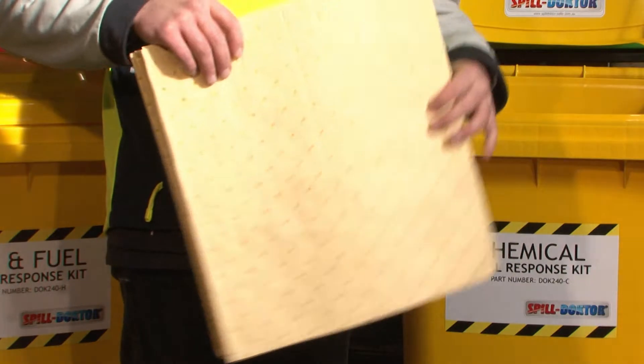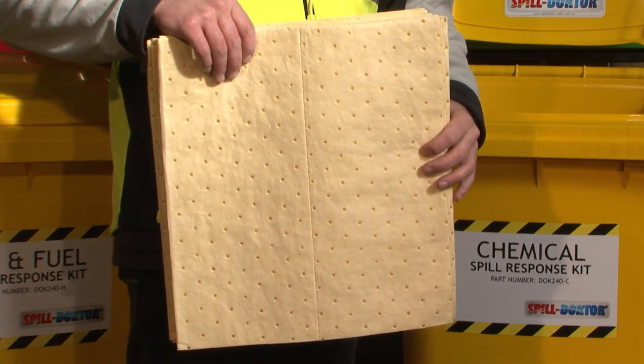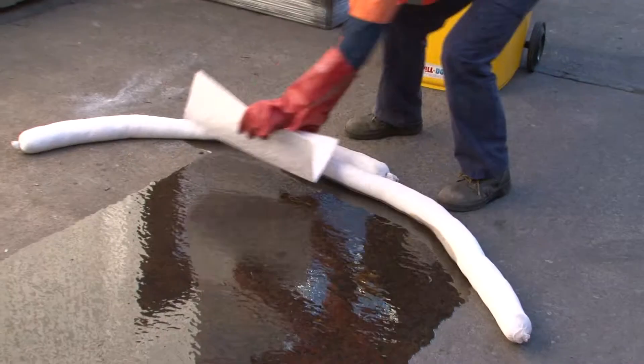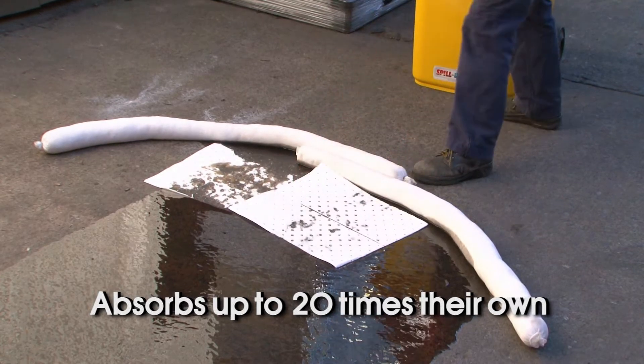Absorbent pads. Pads are used for absorbing the bulk of the spill inside the perimeter of the mini-booms, or may be laid down to reduce the risk of slipping. Spill Doctor absorbent pads will absorb up to 20 times their own weight in liquid.